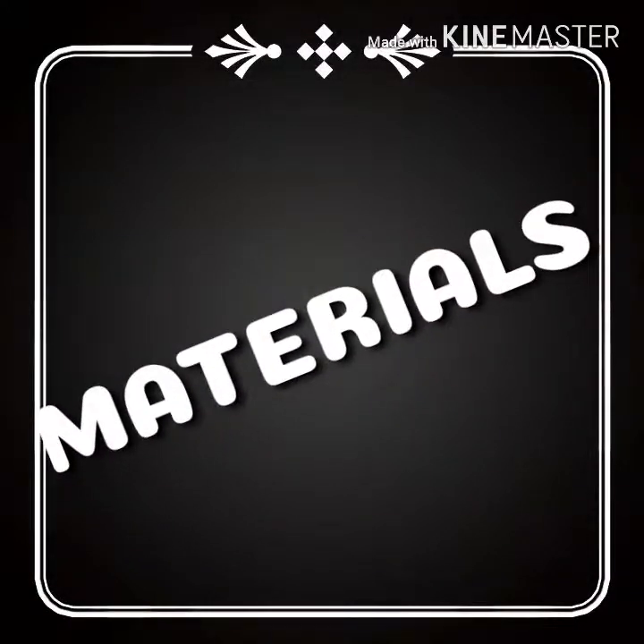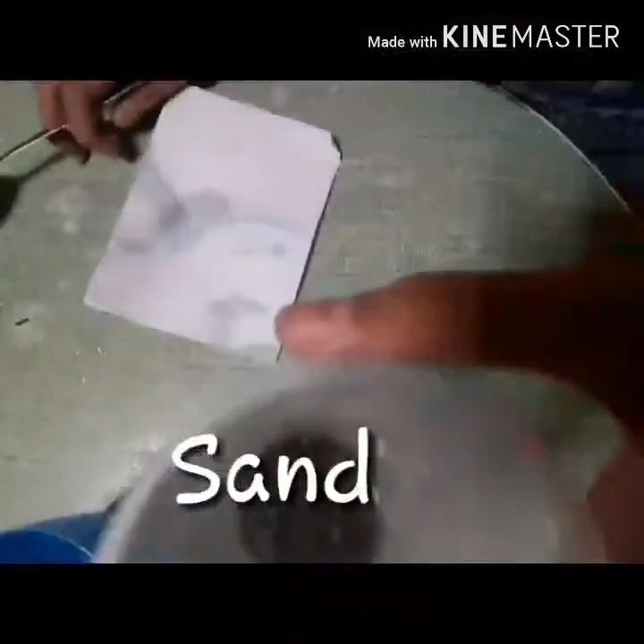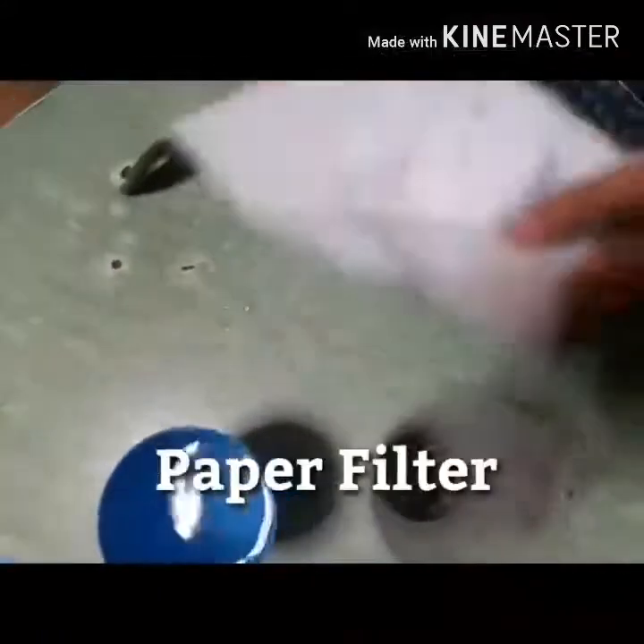Now I'm going to show you how filtration works. The materials are water, sand, and a paper filter.